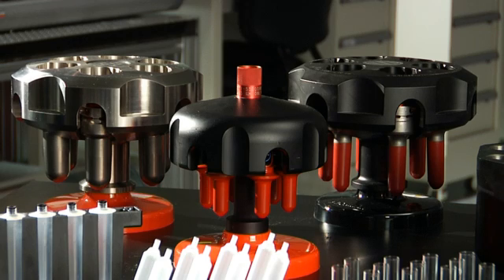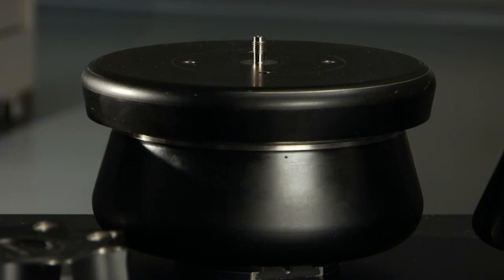A total system approach to your ultra-centrifuge needs — instruments, rotors and labware to complete the job, no matter the requirements.